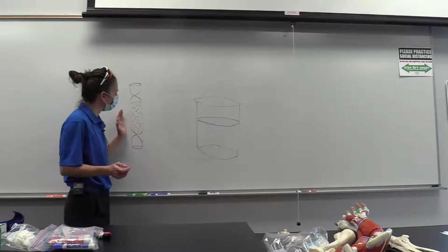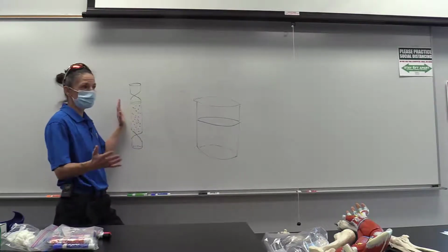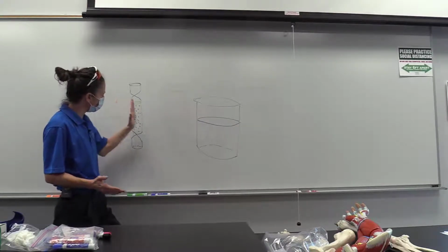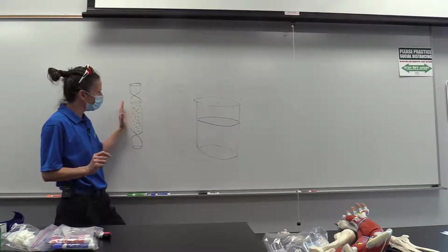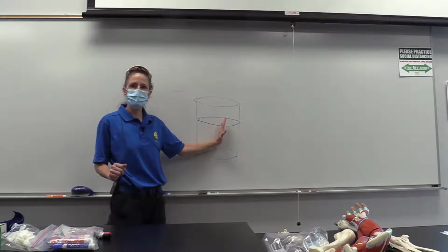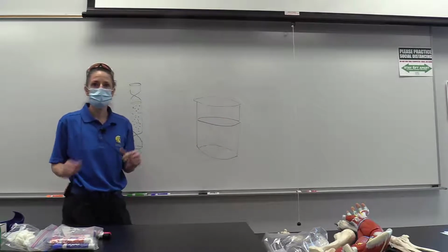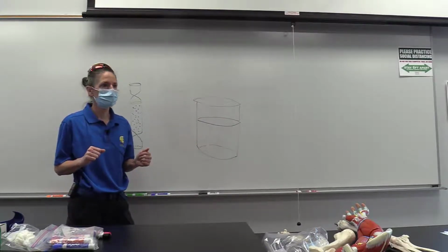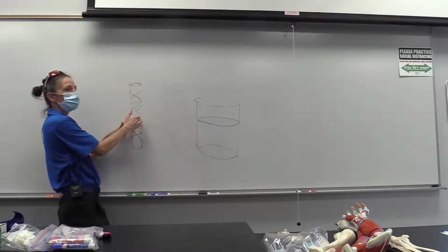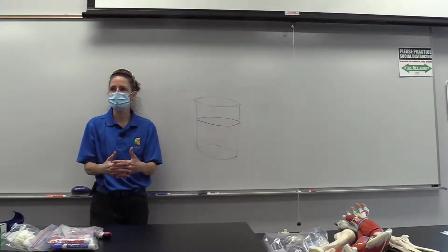In the case where we had the starch solution, and I think Dr. McCann used starch in his, we can also use sugar, salt, just about any of those. His had the starch solution inside the bag for one of the experiments, and he put the bag in the beaker and then left it there for an hour. So after an hour, what happened to the bag when we weighed it again? It got heavier, exactly. It got heavier because there's more solute inside. It had the hypertonic solution inside, so water from the beaker went into the bag.